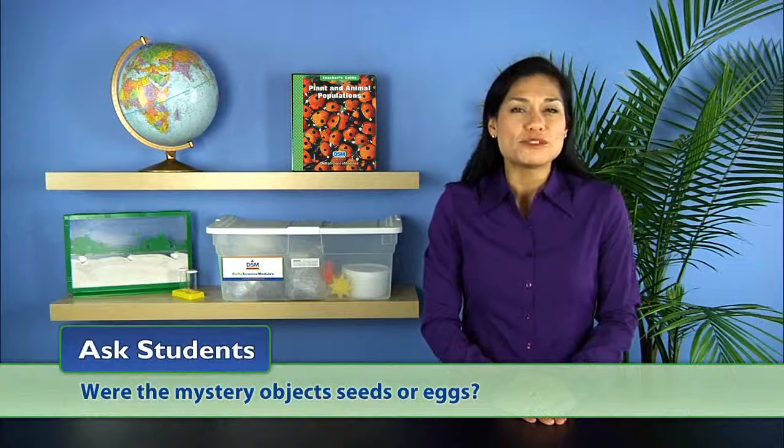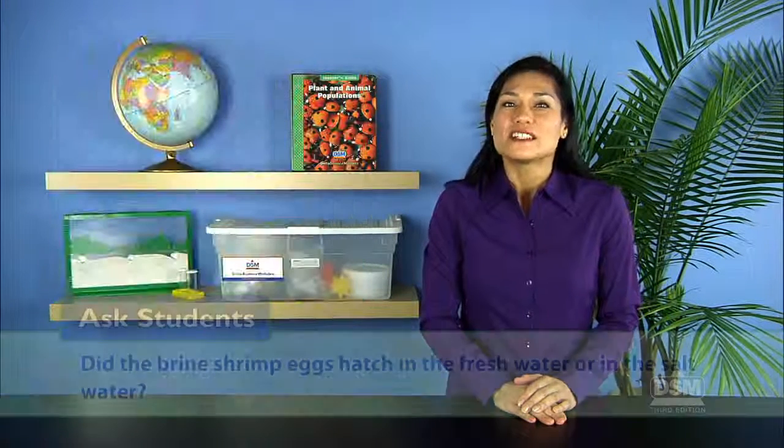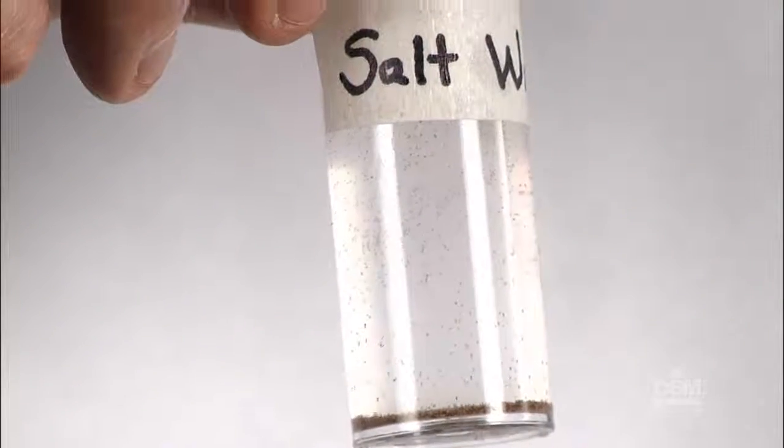Since the brine shrimp are swimming around, most students will probably say that they must be animals. Then ask, were the mystery objects seeds or eggs? Students should see that since they turned into animals, they must have been eggs. Inform students that these animals are called brine shrimp, tiny relatives of the shrimp that people eat. Ask students, did the brine shrimp eggs hatch in the freshwater or in the salt water? They should understand that the brine shrimp eggs hatched only in the salt water.